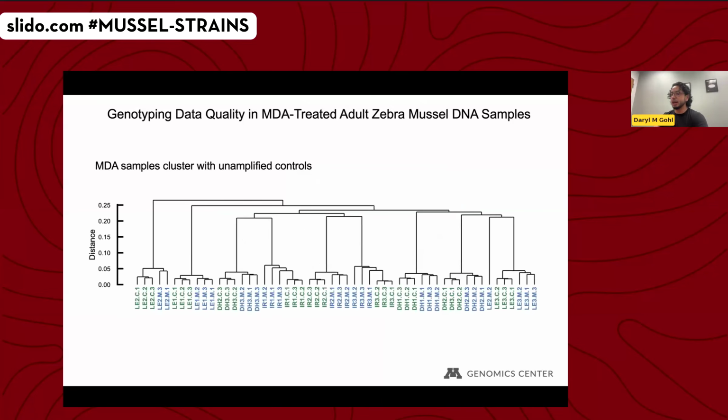And here, for the genotyping data that we generated in this experiment, we calculated the genomic distances, where numbers close to 0 in this image represent a bigger chance of genetic similarity.